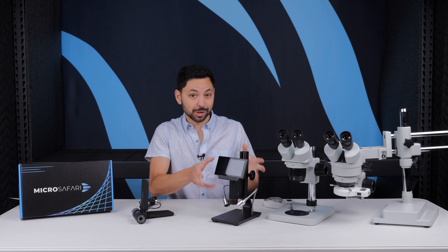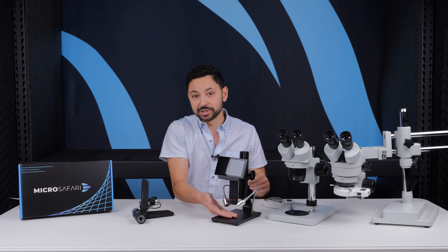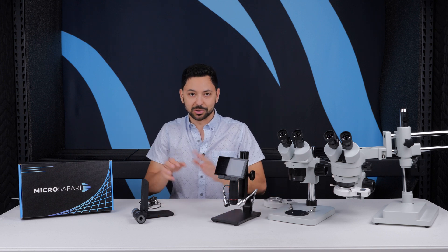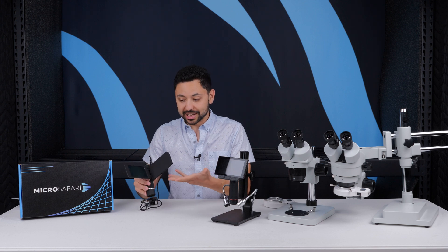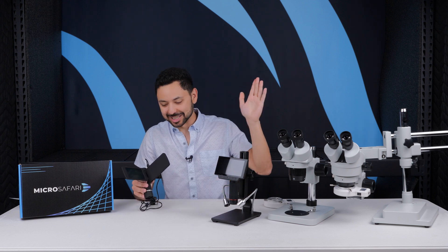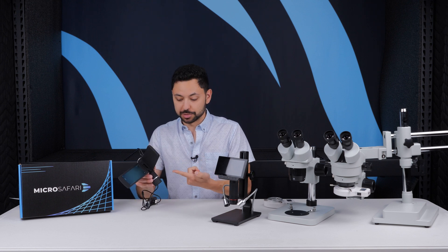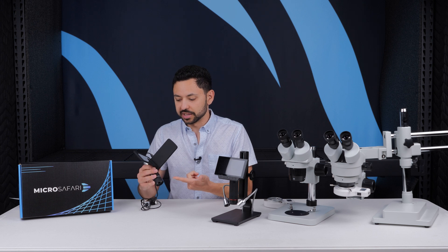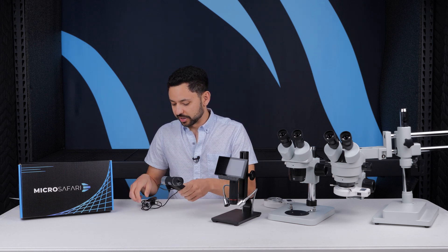That's where having a digital microscope on a stand comes in, because now you can just put an object under here—put a $20 bill under there, you move the dollar bill, you don't move the microscope, and that works really, really well. That said, the portable aspect is fantastic—go send your kids off to the woods and they're going to have a good time. Alternatively, this actually comes with a stand depending on which model you get, and the kind that we carry typically comes with a stand. So that's what I recommend.